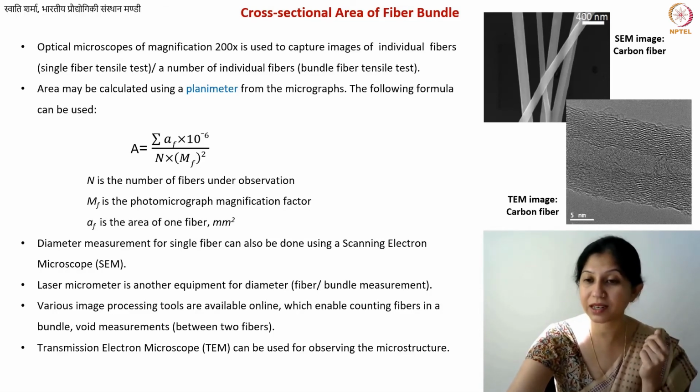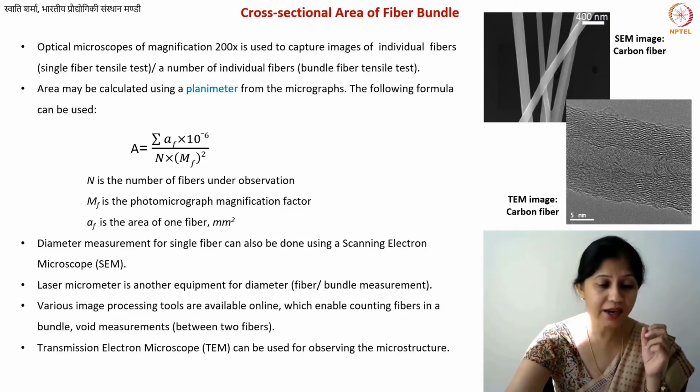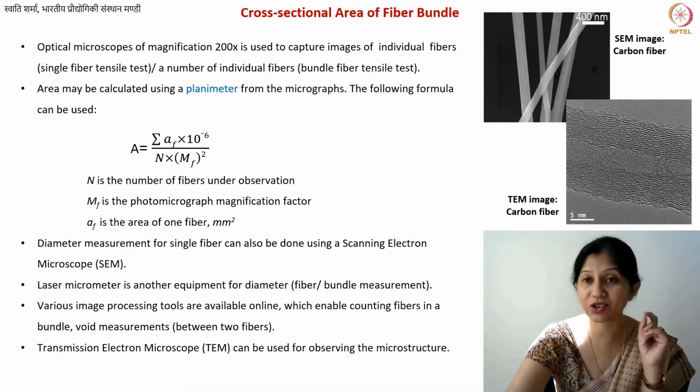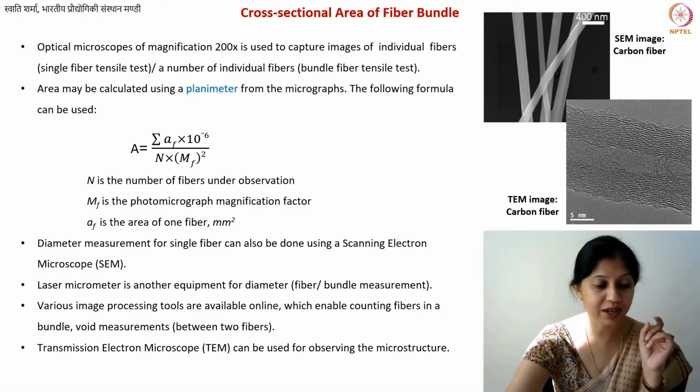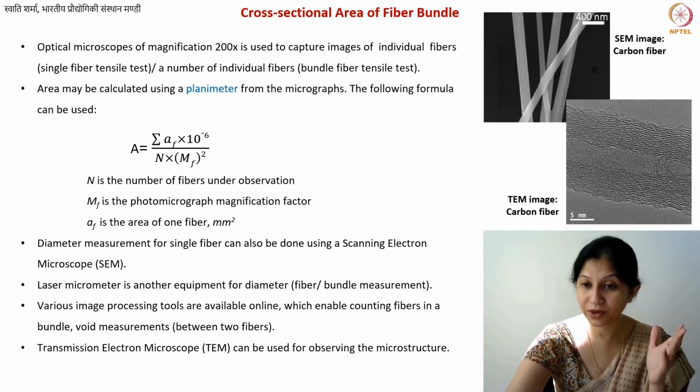But here in this particular case, you see that the fiber diameter is approximately 20 nanometer. And you can see how the chains are aligned. Actually, these are the chains that I call turbostratic. So you can see that these are these wavy chains. And if you actually measure the distance between these chains, then it is higher than what you will get for ABAB type graphite crystals. So these are some of the methods for calculating various values for carbon fibers.